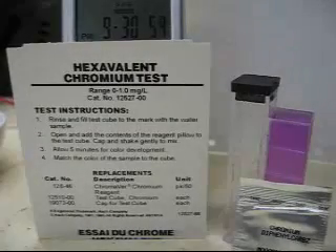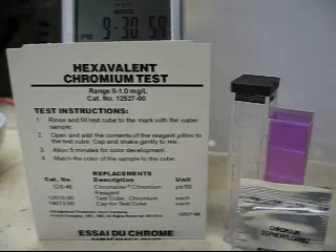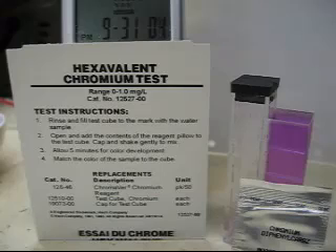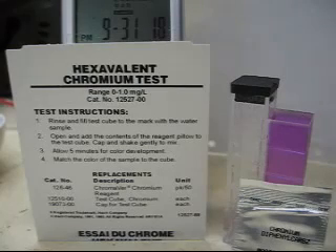Good evening folks, Mr. Salty here. I'm sure you've seen on the web lots of talk about hexavalent chromium being in our electrolyte water after it's been run across the plates. So it got me curious enough to buy a hexavalent chromium test kit provided by Hawk Company. It's about 20 bucks plus shipping. So I want you to see my results.